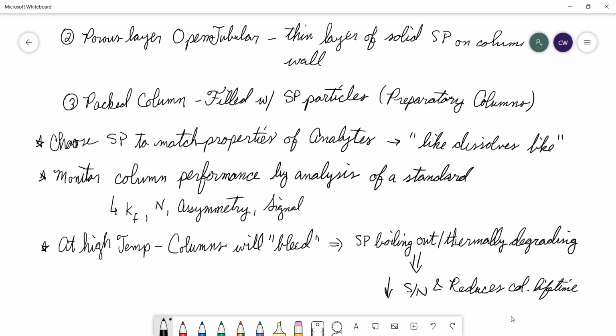All right. Now, I want you to get an idea out of your head. You will sometimes read or hear people say that they deliberately bled their column because something stuck to their column. You know better than that, right? Equilibria are dynamic processes, okay? They can be very, very slow, but they don't stop.